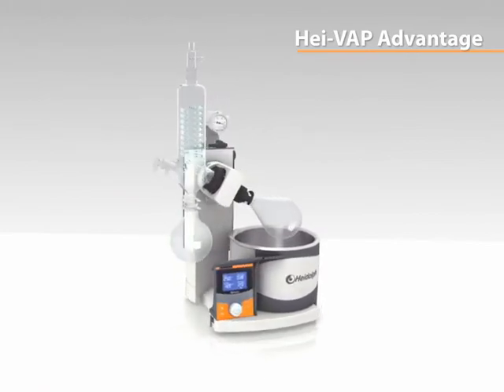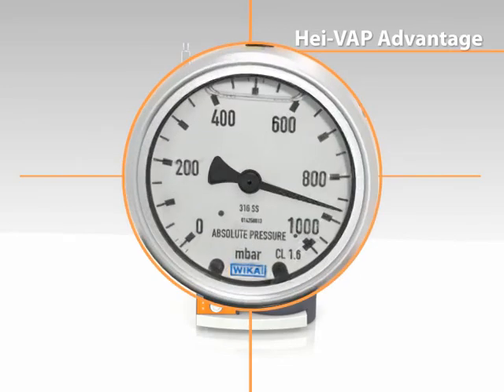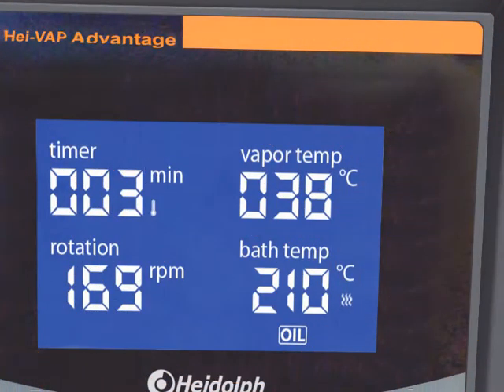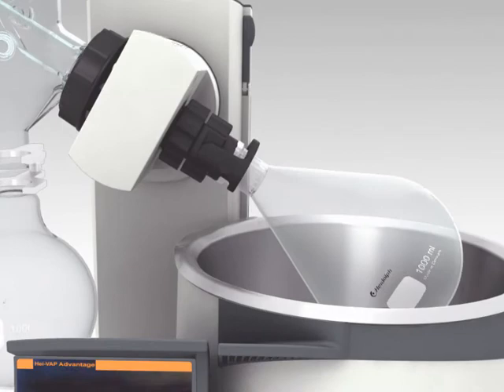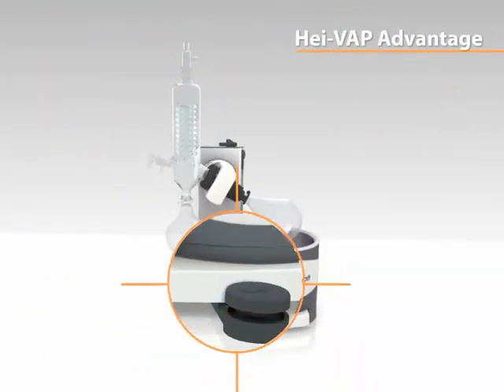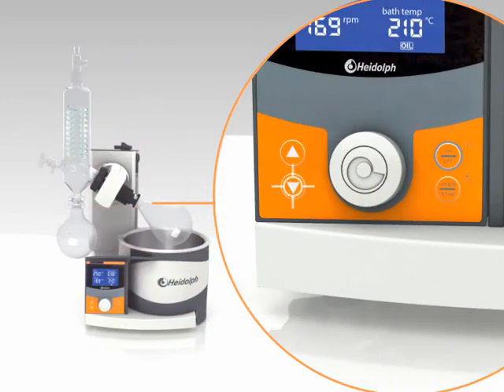Upgrade your Hive VAP Advantage with an affordable manual vacuum controller for pressure regulation. The automatic process timer turns off your evaporator at a pre-programmed time and removes evaporating flasks from the bath on motor lift units only. Choose between affordable hand lift models or motor lift models for added convenience.